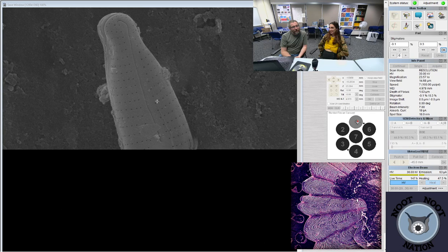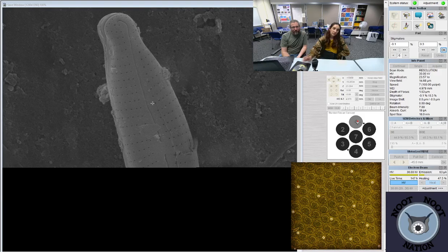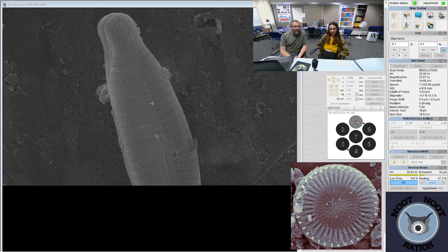So the top and the bottom of the valve look totally different. Yeah, this one's bigger, rounded. Right? Yep. That's the dorsal side. That's the ventral side, and it's flattened. So the top one is rounded, the bottom one is flattened. And it's just subtle, but it's there. And I would guess Symbopleura as a result.